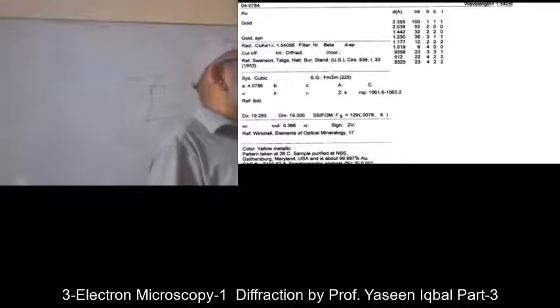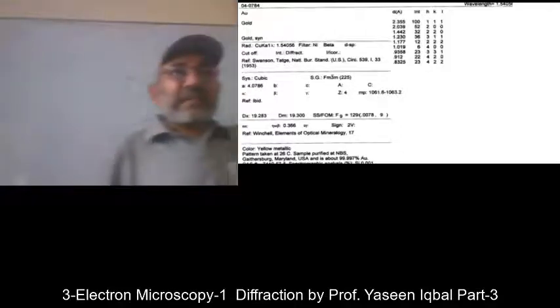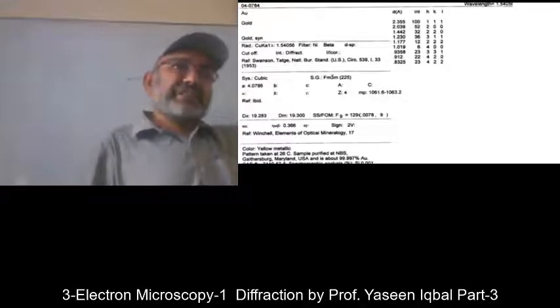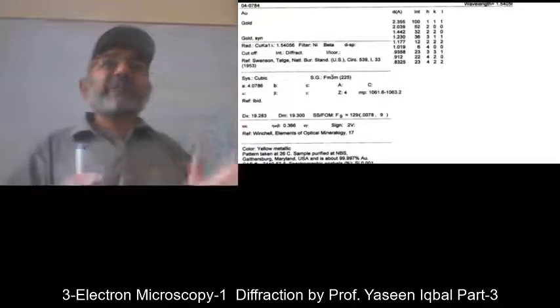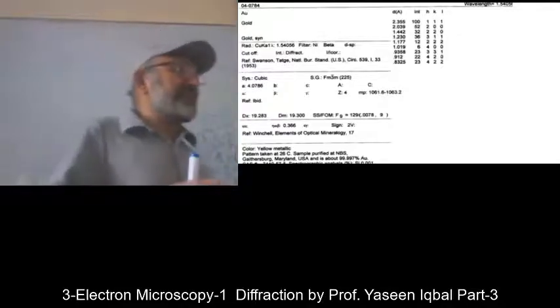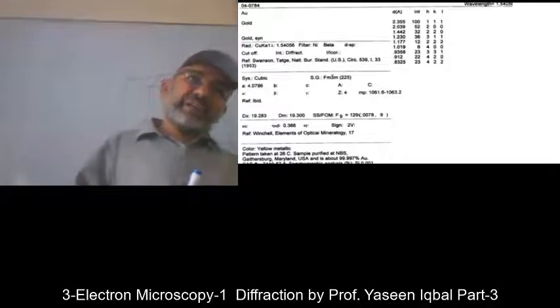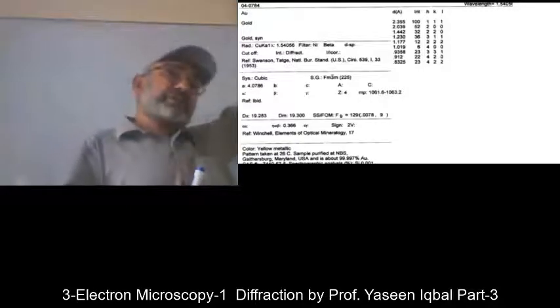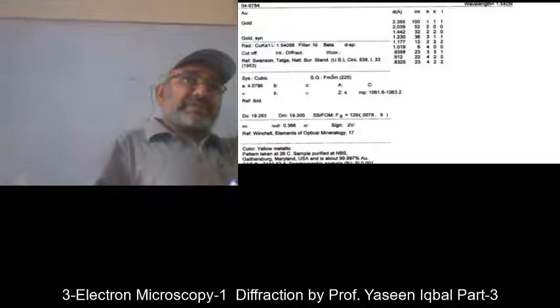When you got these d-spacings and they are already represented by the relevant Miller indices, HKL indices, then calculate the angle between different indices. Indices means planes. And if the interplanar angles are matching, the d values are matching, then you say this is because of this phase.